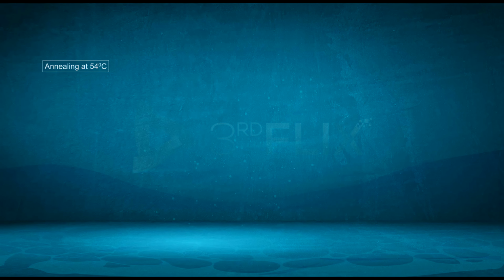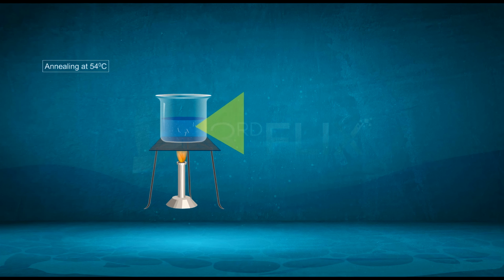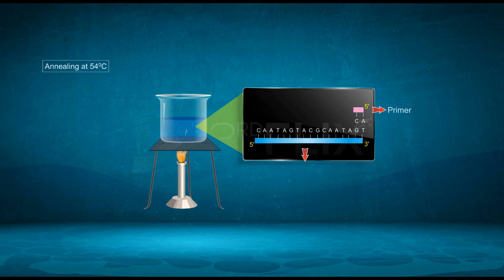Annealing at 54 degrees Celsius. As primers move around in a Brownian motion, bonds are established between single-stranded primer and single-stranded template. The primers, which are stable after attachment to the template, initiate the copying of template with the help of polymerase.